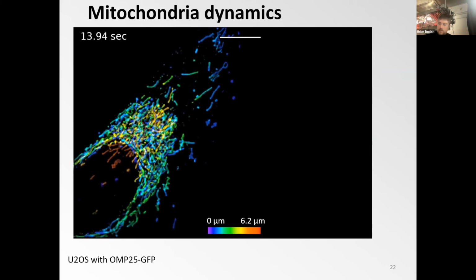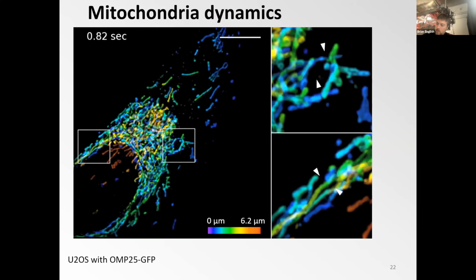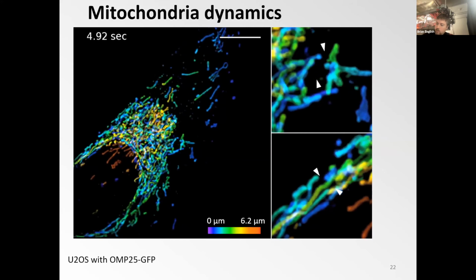And so as such, it is not hard limited how fast it can go. This is essentially at 1 millisecond or below 1 millisecond exposure time. It was essentially limited by how fast the camera could go.